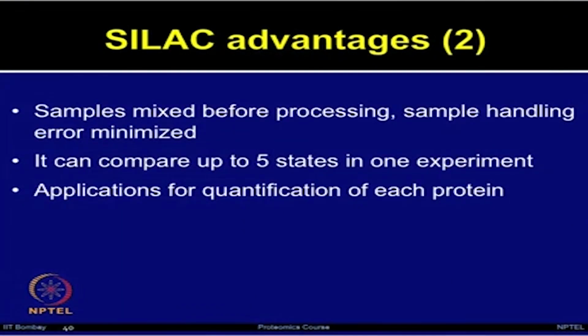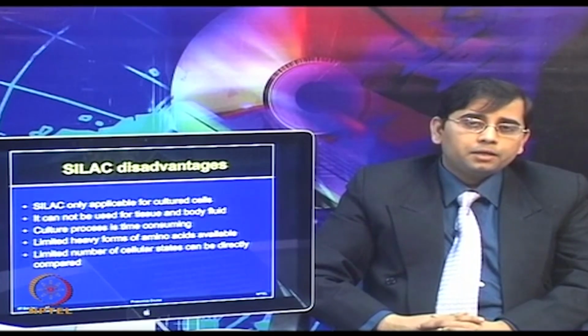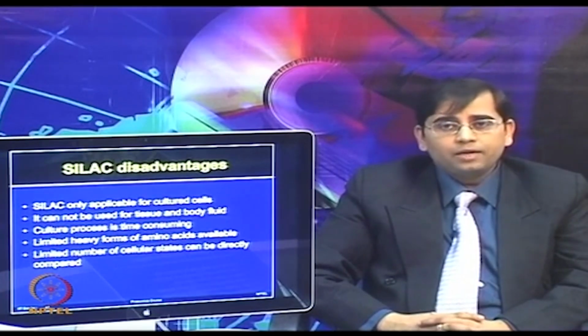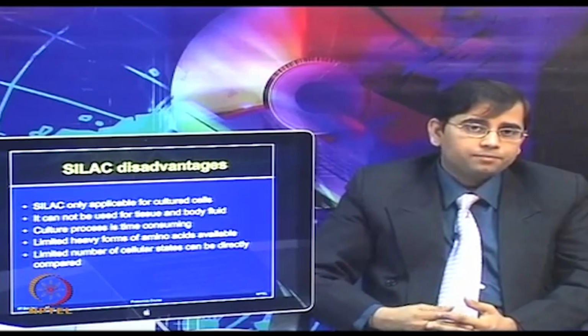Now, SILAC experiments have demonstrated that it can provide the 5 plexing capability to compare 5 different states in one experiment. So, there are various applications of quantification of proteins by using the SILAC method, which we will discuss in the next few slides. Although there are many advantages of using SILAC, there are some disadvantages due to the inherent nature of this method.